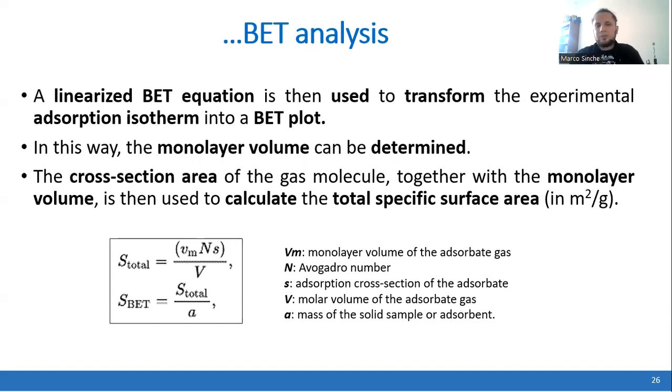this data could be transformed to the total specific surface area of the material, which will be represented in square meters over gram, which means that it is a characterization of how porous this material is.